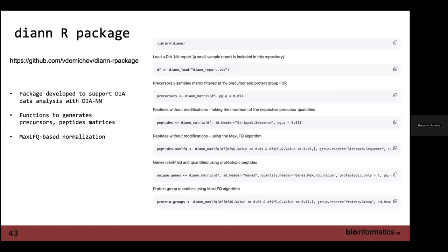We'll really quickly touch on this because you will get more experience actually using this package. But Diane, unlike MaxQuant with Perseus, or Spectronaut, does not have a visualization suite. So there is a Diane package made specifically for interpreting the DIA-NN outputs, which is available. It's not actually DIA-NN, it's just called Diane. This is one that's a GitHub download, so I believe it is already in the environment on the Amazon Web Service. But if you were doing this on your own back at your own labs, it's quite simple. You can just go to the GitHub, and there are instructions for downloading and using the software as well.